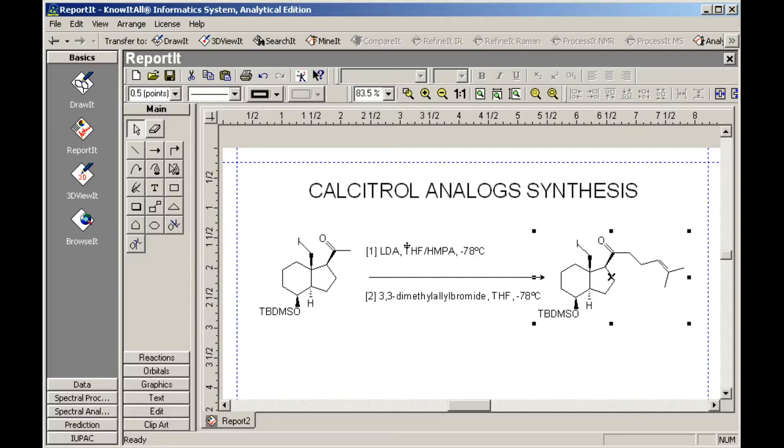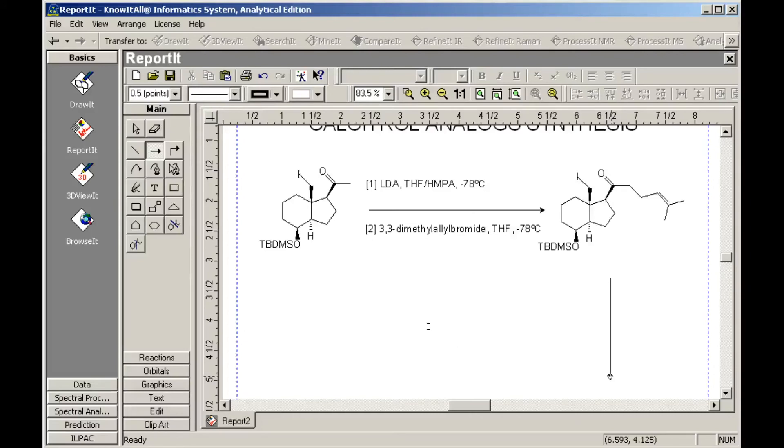Next, we'll add another reaction arrow. And another text box. Right-align the caption, then use the subscript tool to format the chemical formula.